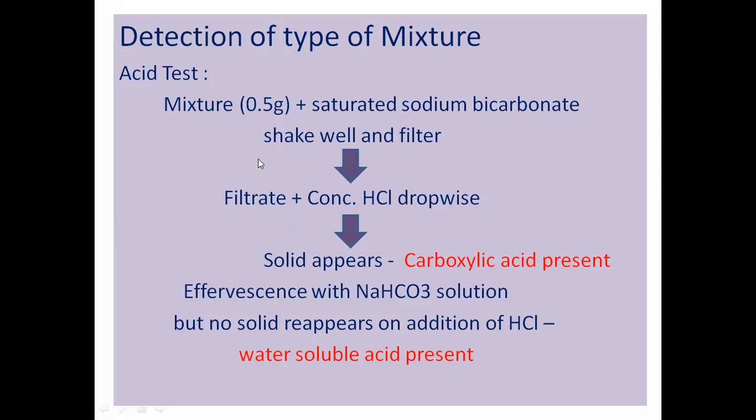It contains, if the acid is present, okay? If the acid is present, then the filtrate contains the sodium salt of acetate. What happens? In COOH, that H gets replaced by Na. Okay? And CO2 is formed and water is formed.